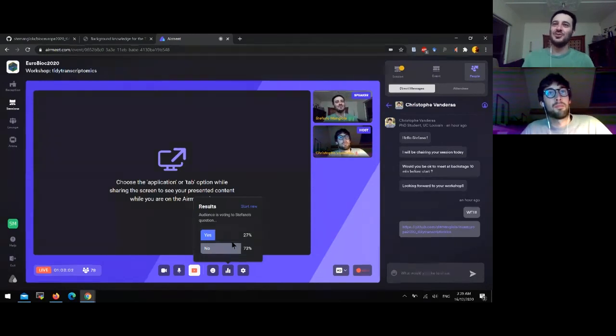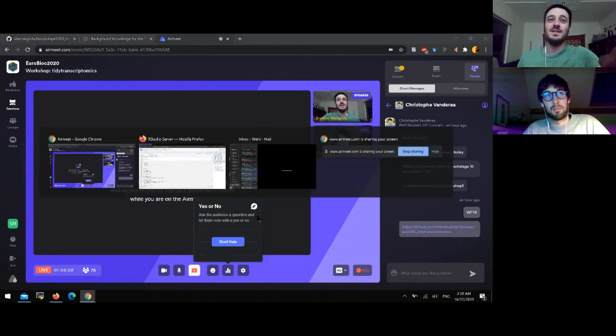Okay, yes, as normally the minority of people use this. I will show you what nest and map do, but some of the code relies also on this abstraction, which is extremely powerful. So I recommend, aside from this workshop, to really have a look at the functions nest and map, as they will make your life so much easier in many circumstances.